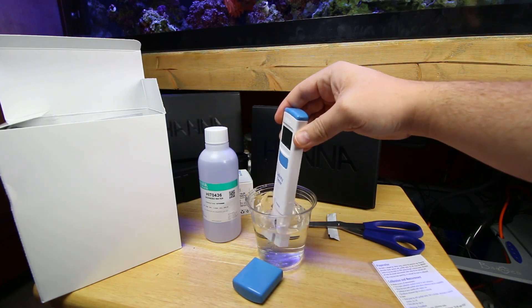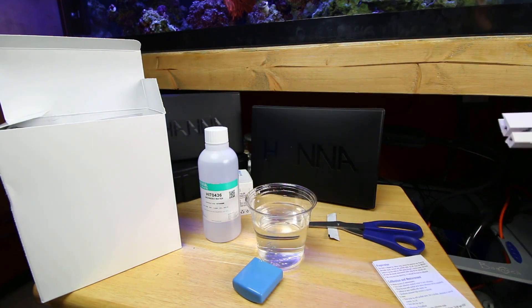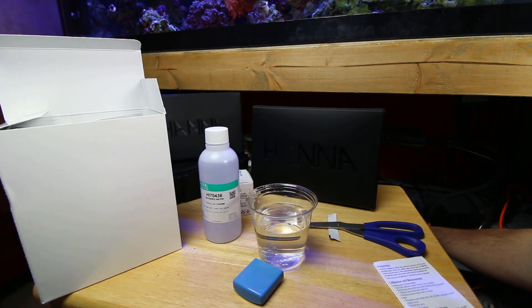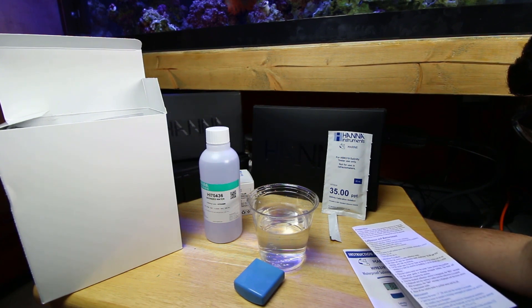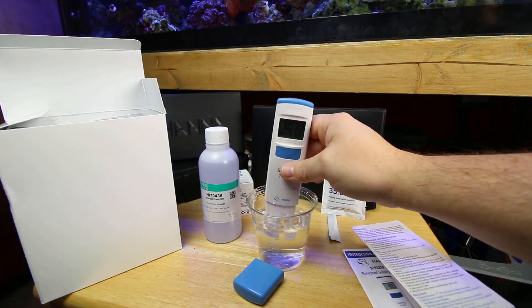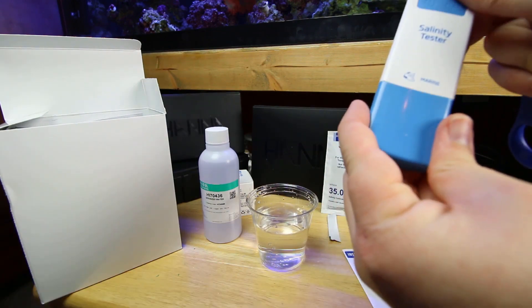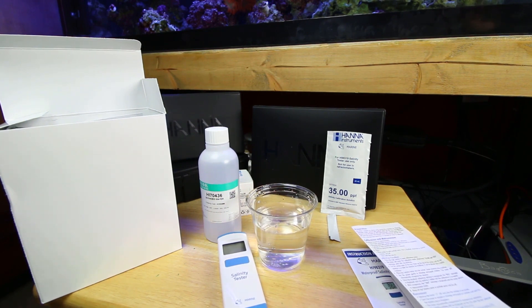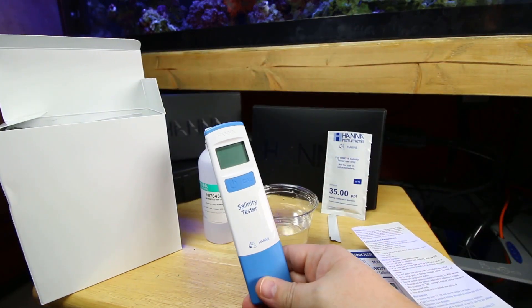Now that we're done calibrating, we rinse it off so the solution doesn't hinder our test. Then I'll come down here and test the salt water in the tank — go about one and a half inches deep and swish it a little to make sure no air bubbles are on the probe. I'm reading 1.024, temperature of 78.1 degrees. Once done, rinse it off so you don't have salt creep remaining, dry it off, store it with the cap on. They recommend calibrating this every month to ensure it's reading properly.